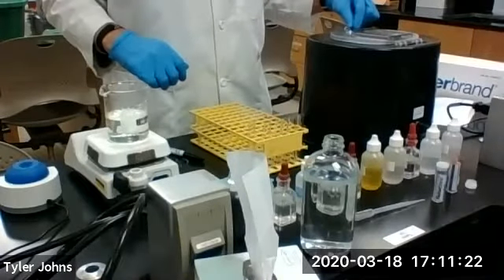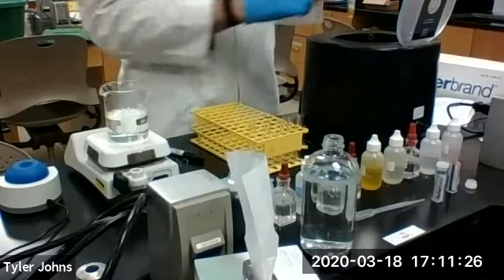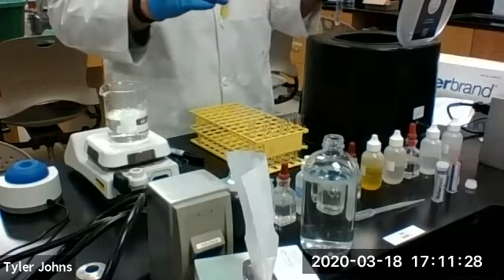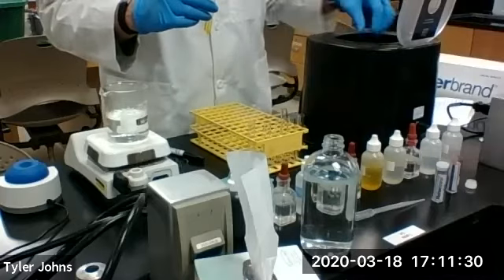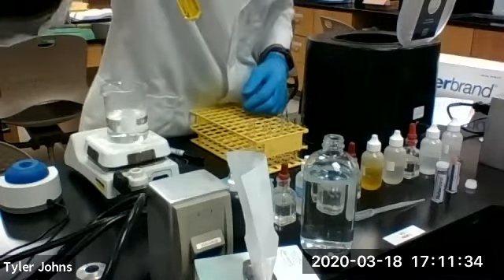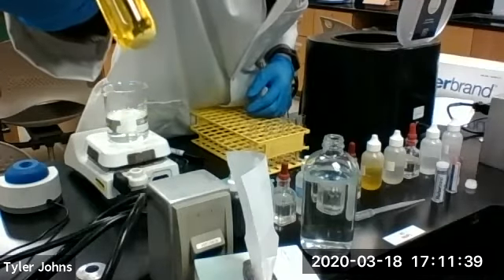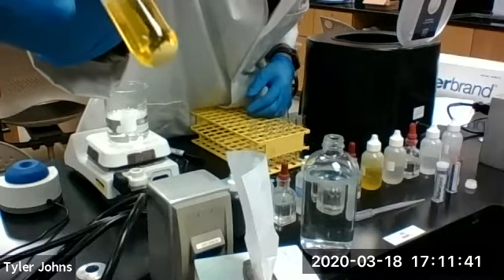Okay, at this point, our centrifuge is stopped. As you can see, we precipitated out and centrifuged down the barium chromate.